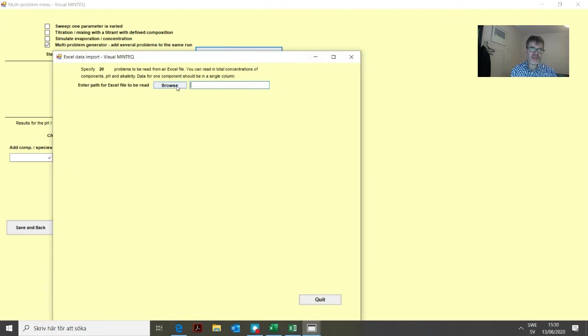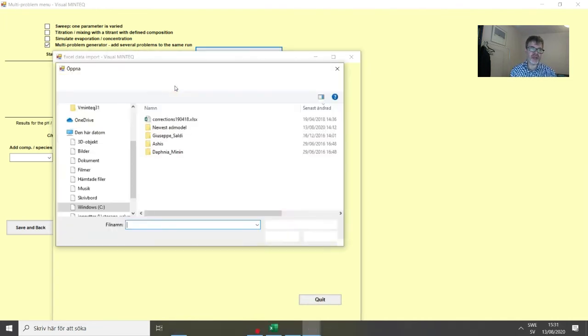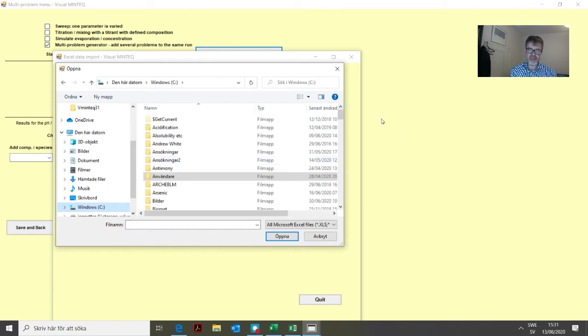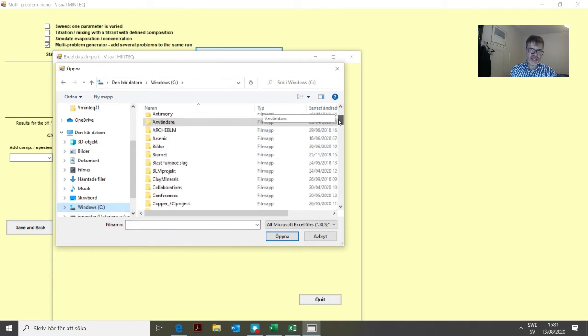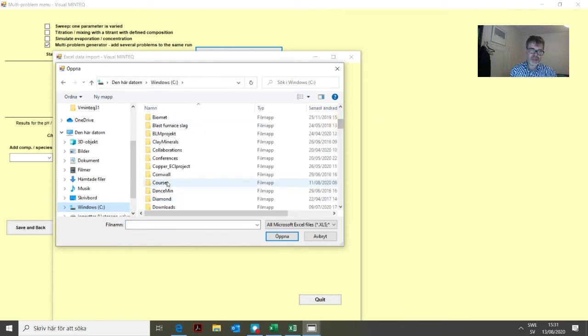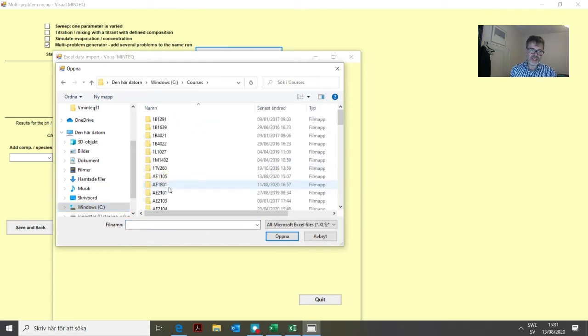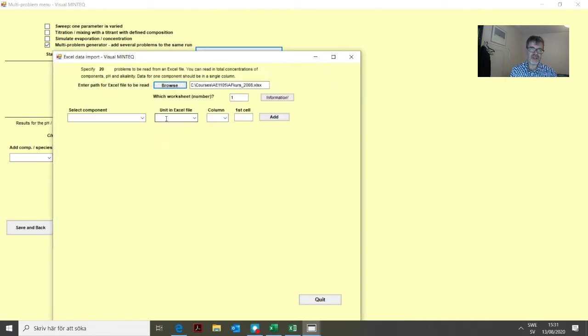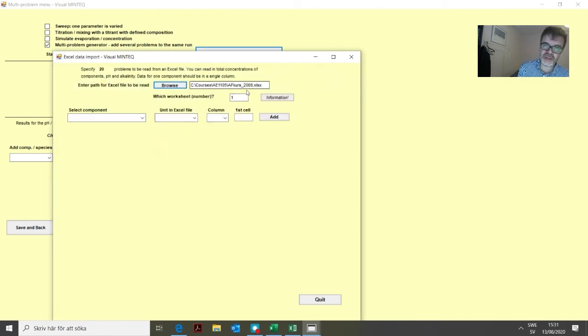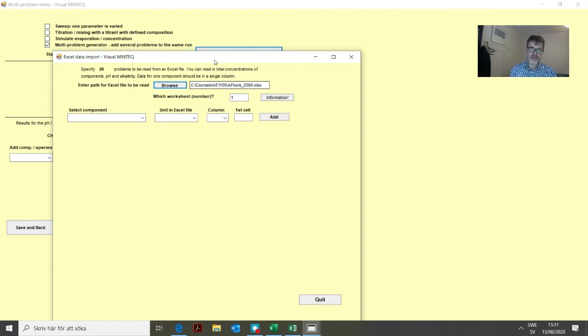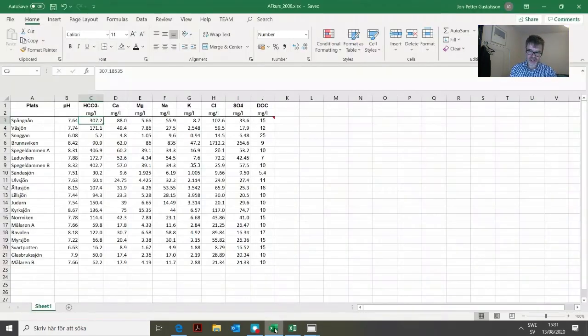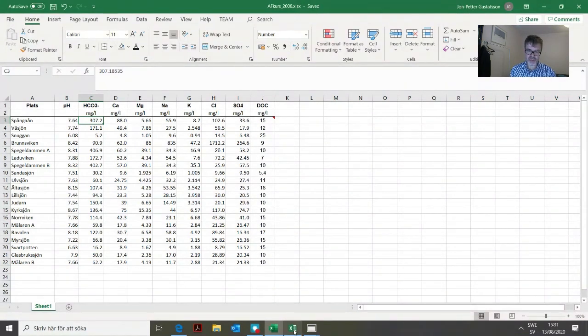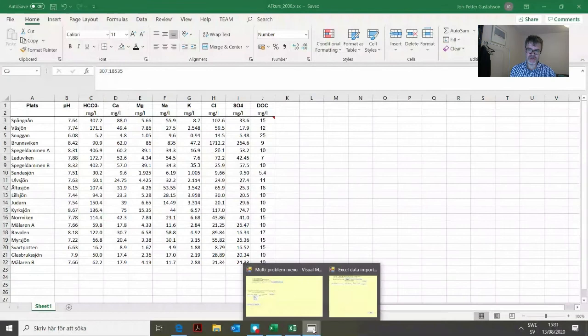We need to find this Excel file. We click browse and find where the file is. Now the program knows the address of this Excel file. The worksheet number is one, which contains one worksheet, so we can leave it at one.